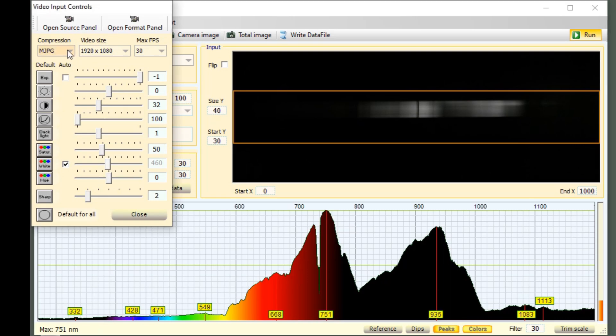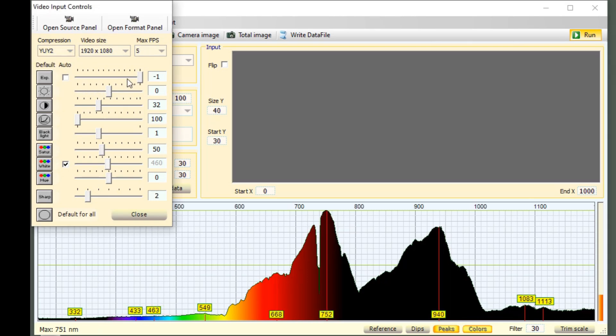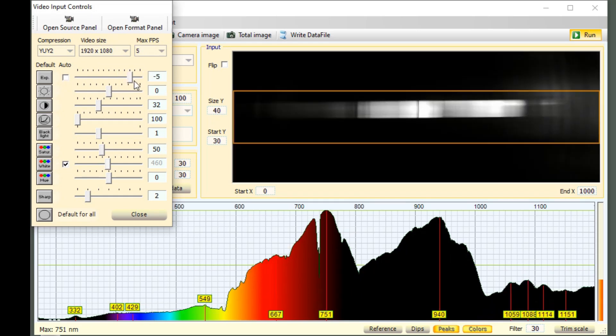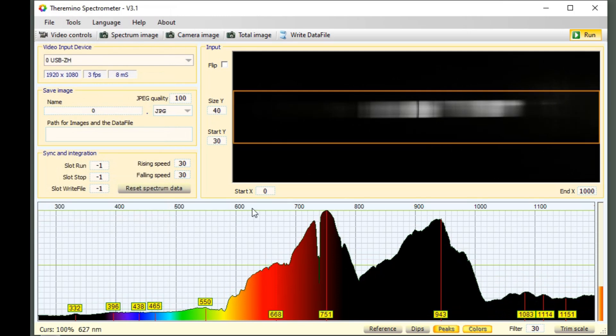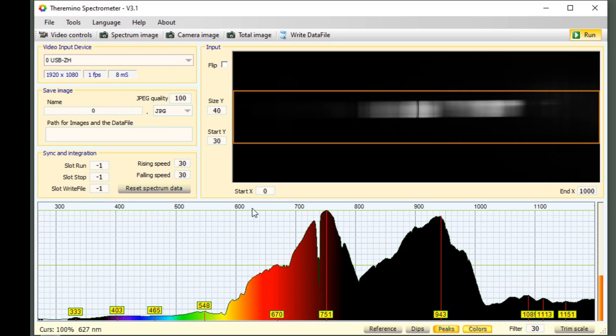Change the compression to YUY2, as the instructions with the spectrometer say, and uncheck 'Auto' here and slide this to the far right so the value is negative one. You can point it out a window if it's daytime and you might see something, but instead let's start with the supplied fluorescent light.